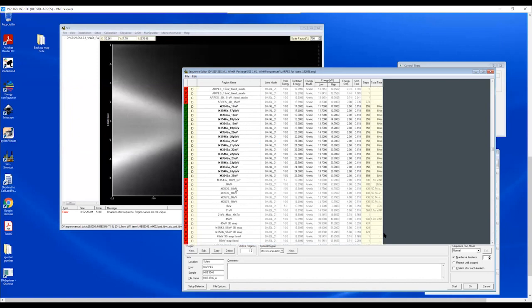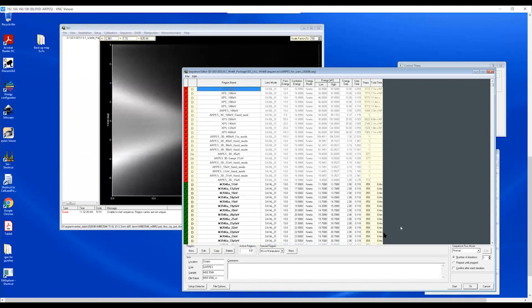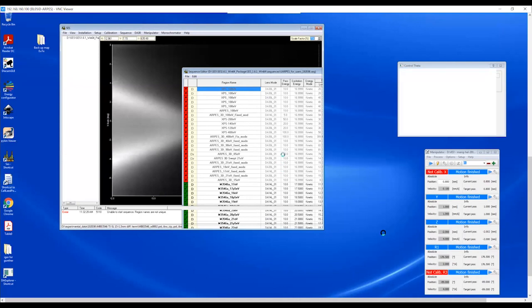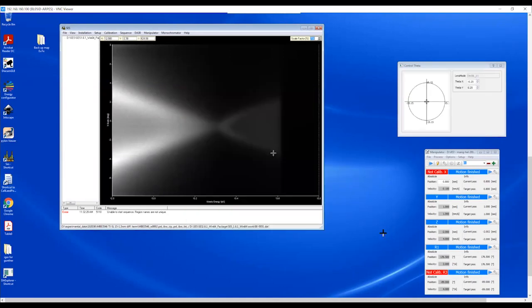But now, thinking about the sequence and region of the start of measurements. Now we have many regions in the cells sequence, and we save these parameters and start the measurements.